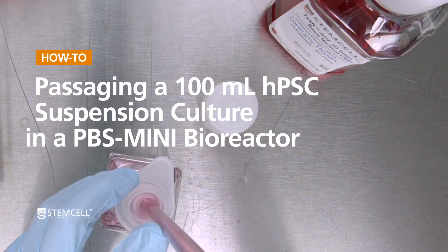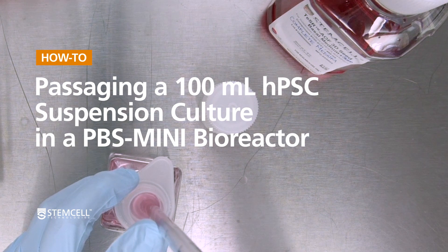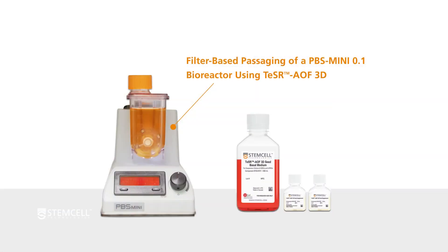In this video, we will outline how to perform a filter-based passage of a PBS-Mini 100 ml bioreactor. Passaging the bioreactor should be completed on either day 3 or day 4 after seeding, or when the PDSC aggregates have reached a size of 300 to 400 microns in diameter.